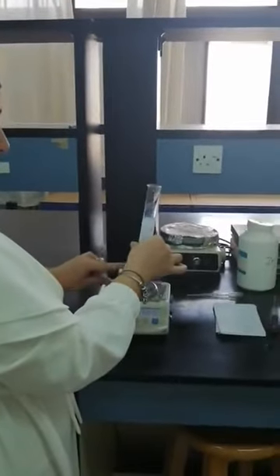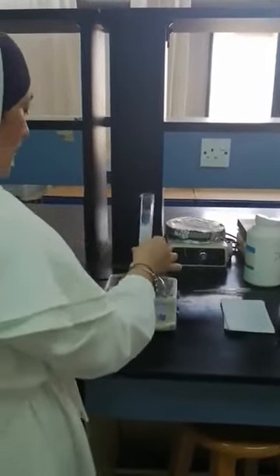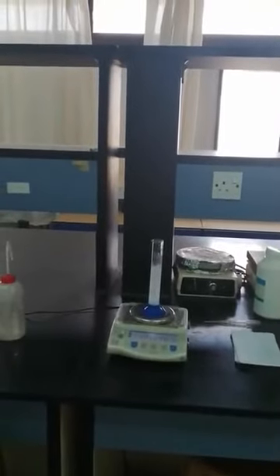The third step is weighing the suspension containing 2 grams zinc oxide and water in the same cylinder. This is W3.